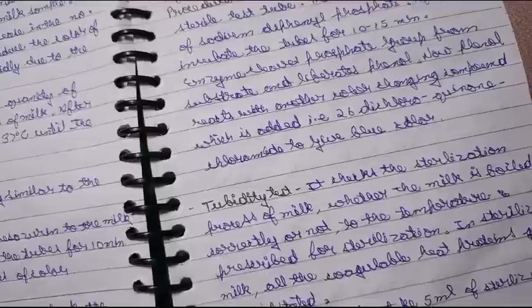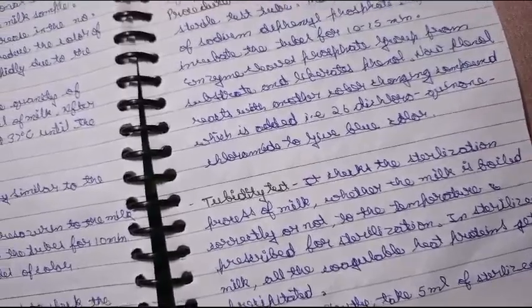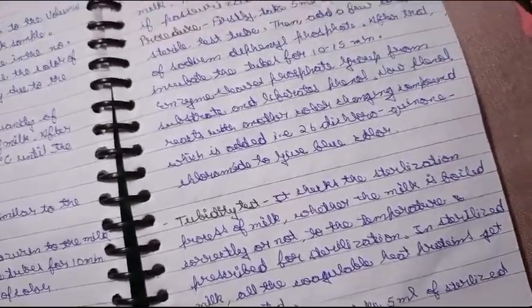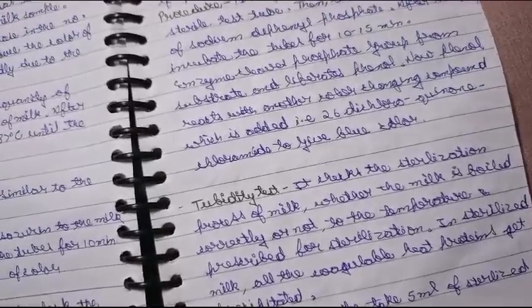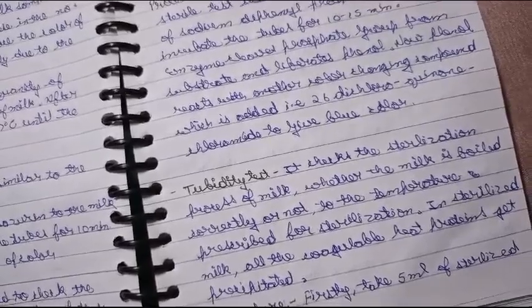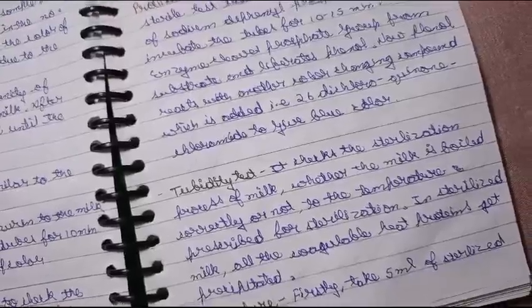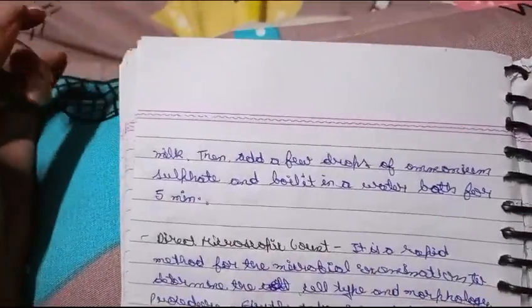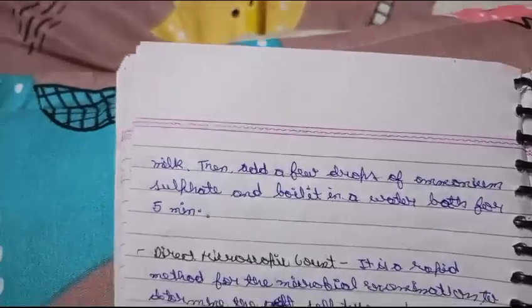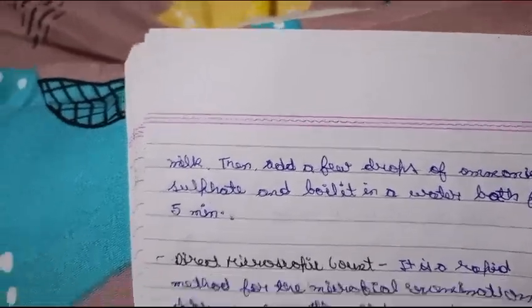Next test is turbidity test. It checks the sterilization process of milk, whether the milk is boiled correctly to the temperature prescribed for sterilization. In sterilized milk, all the heat-coagulable proteins get precipitated. Procedure: first take 5 ml of sterilized milk, then add a few drops of ammonium sulfate and boil it in a water bath for 5 minutes.